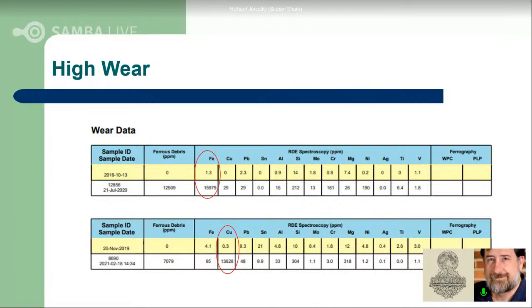Large, abnormal, severe wear is greater than 15 microns in many cases. So we had to actually migrate out of the sweet spot of this technology and really most of the used oil technologies for that. So it can be very good to complement this technology with a ferrous density type measurement.